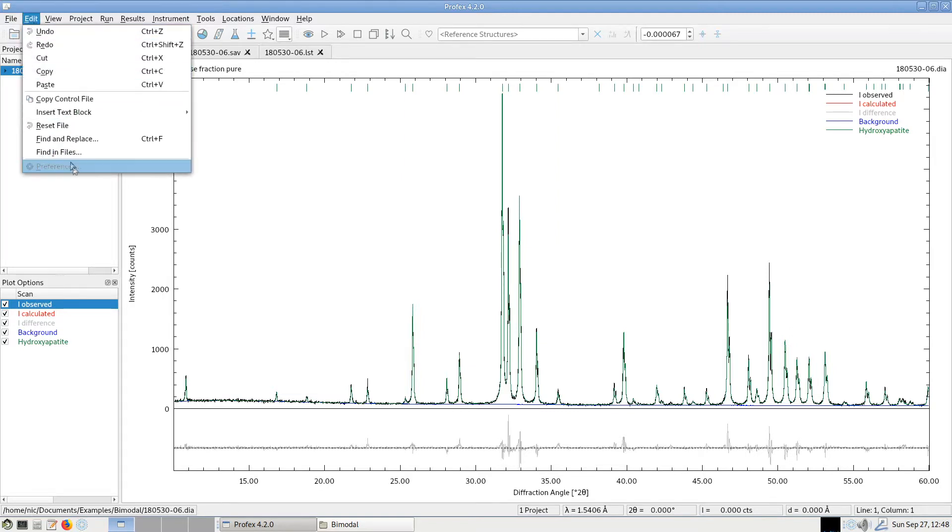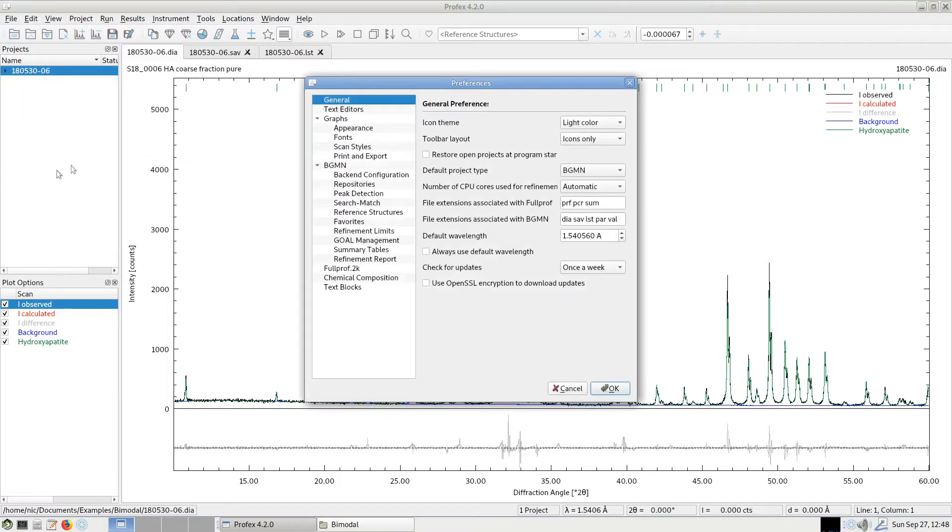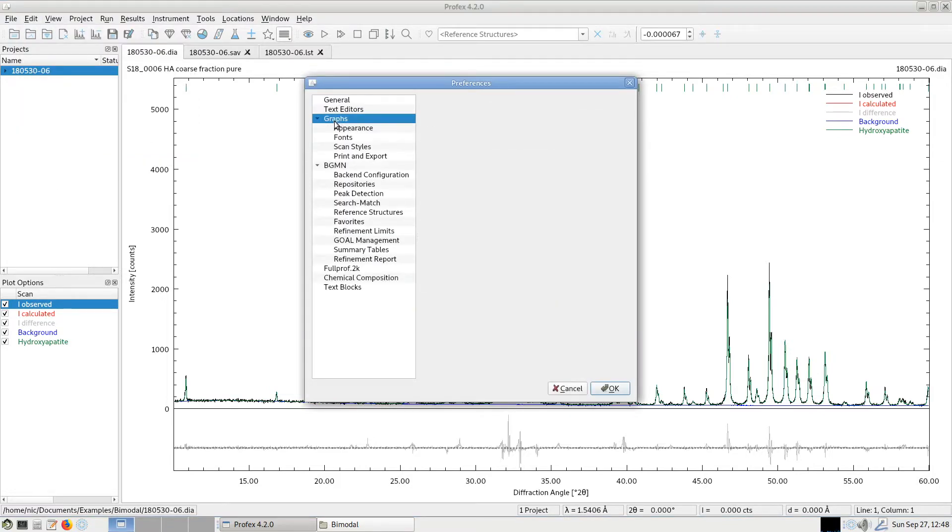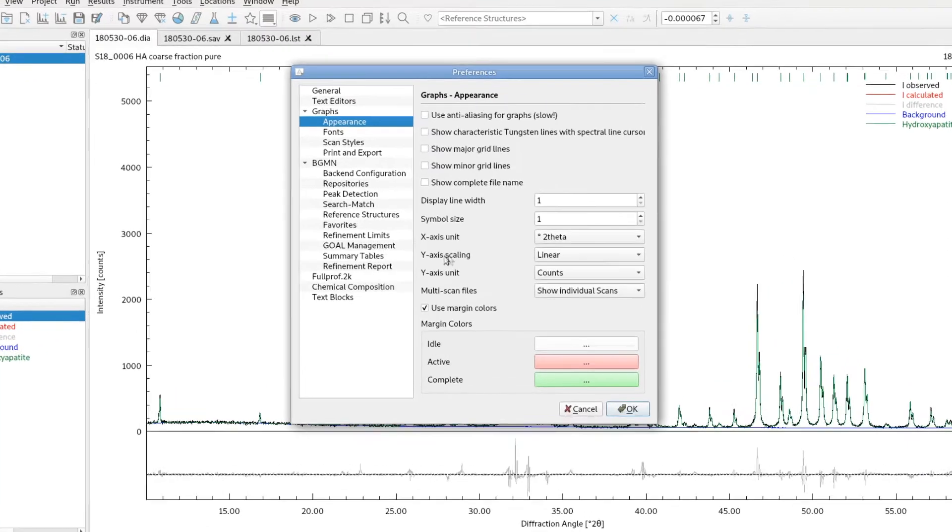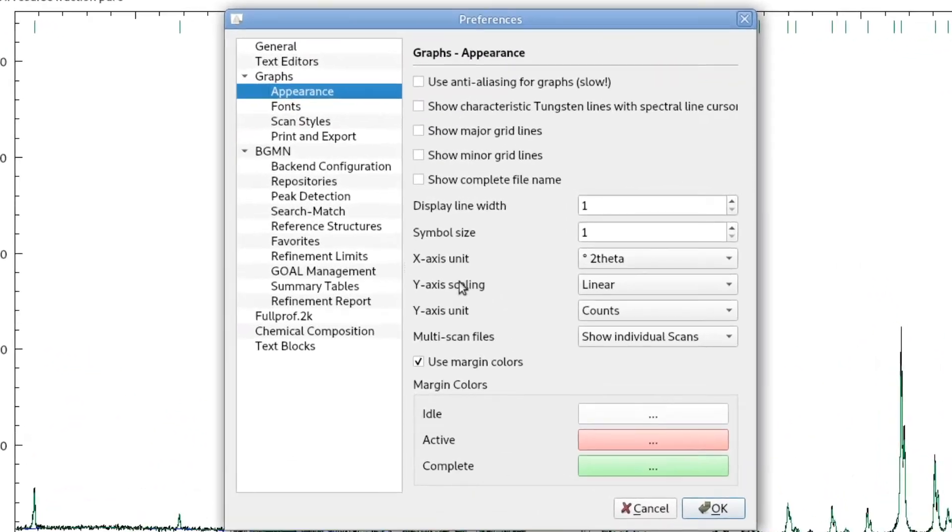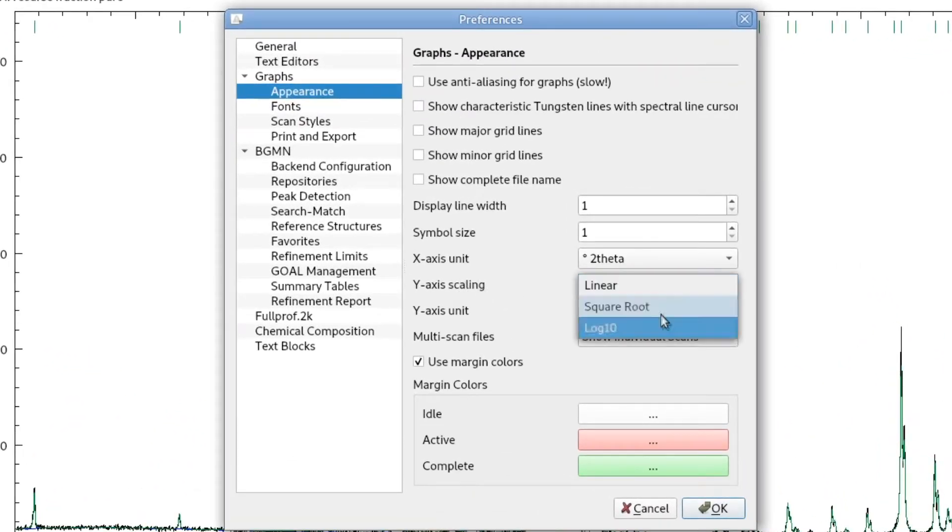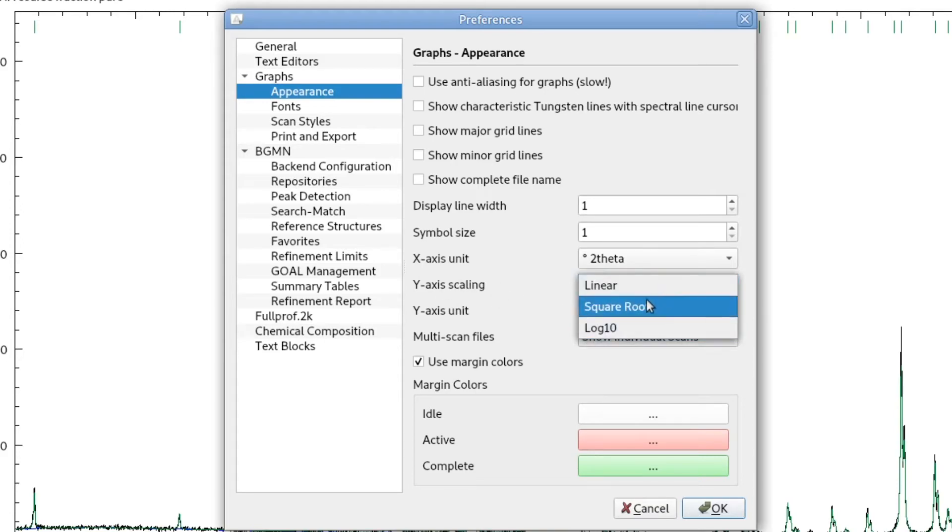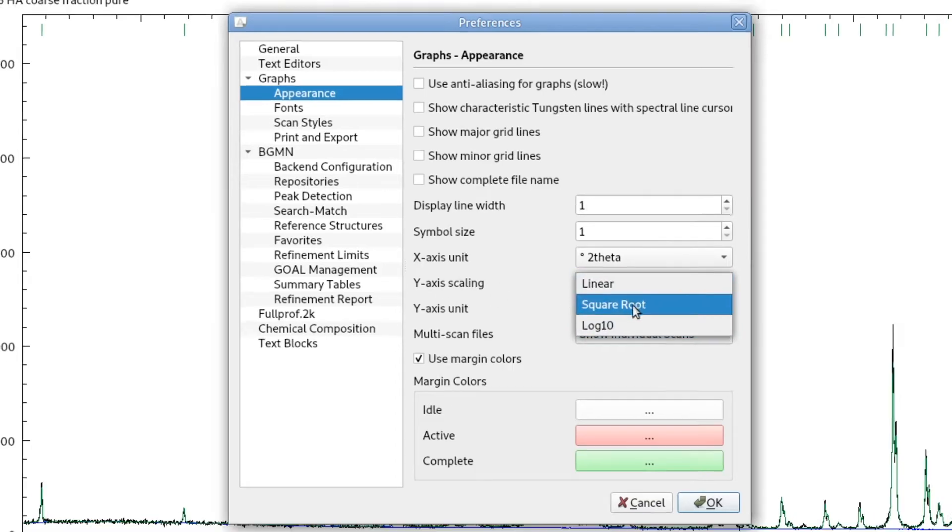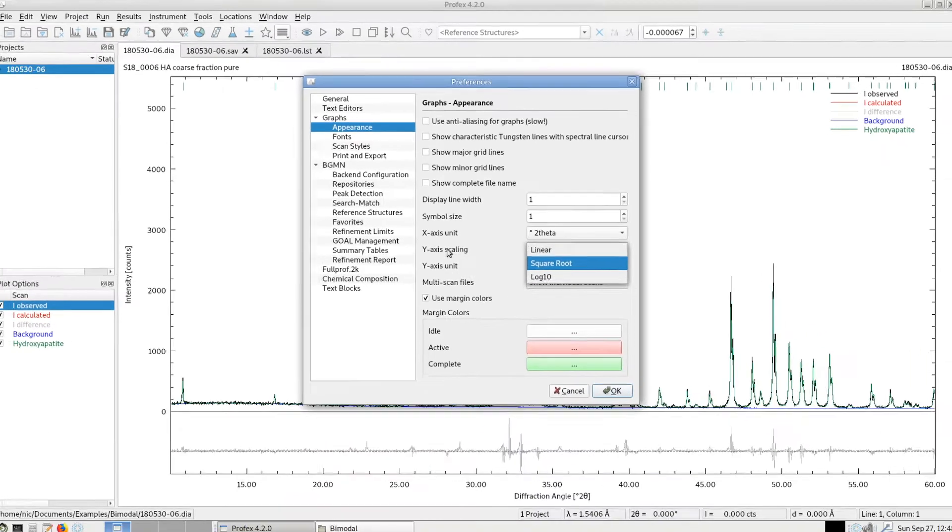We go to Edit, Preferences, Graphs, Appearance. And here we can change the y-axis scaling from linear to one of the other scales. This change will be permanent, so every project will be open with this y-axis scale.